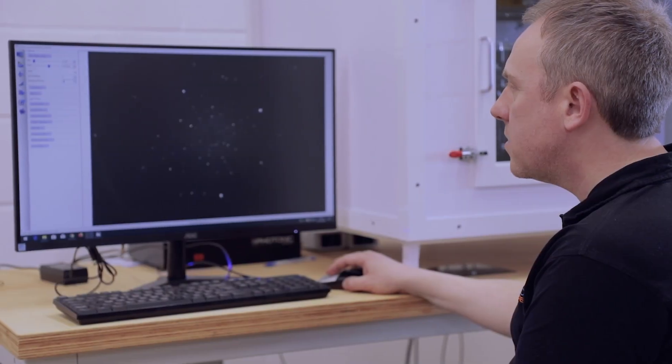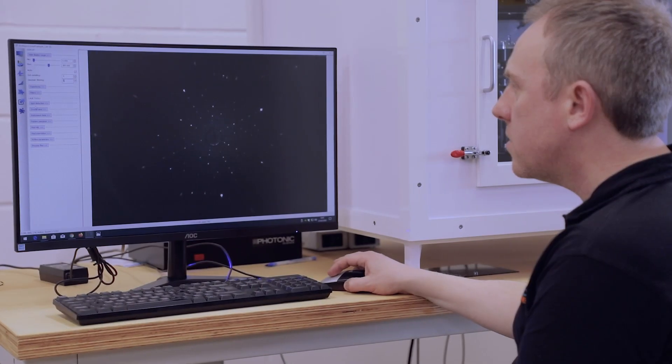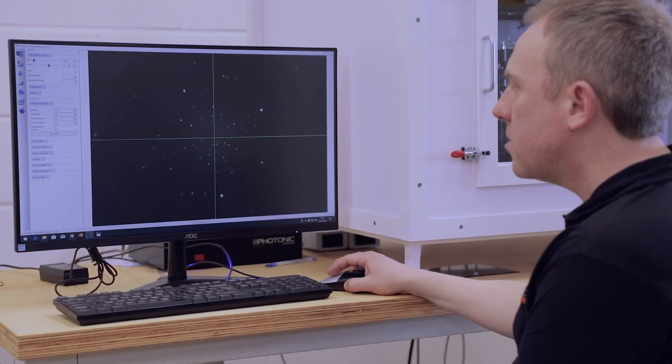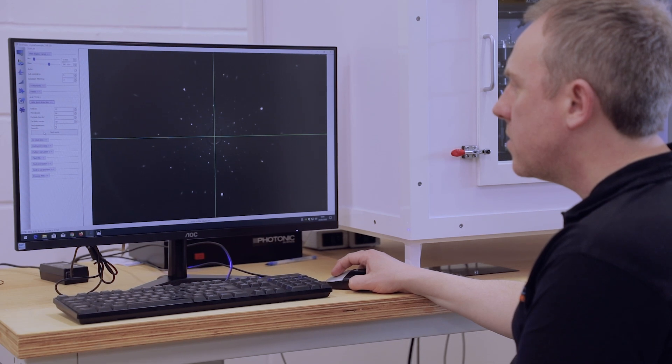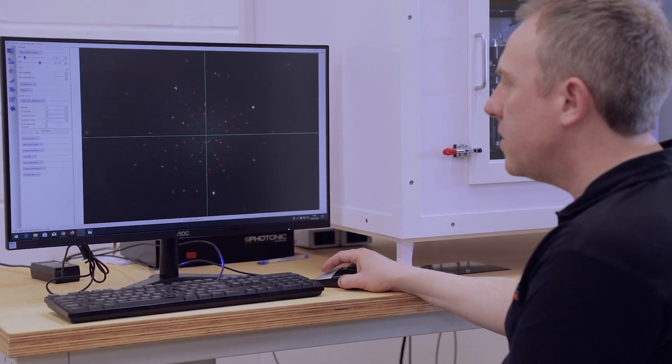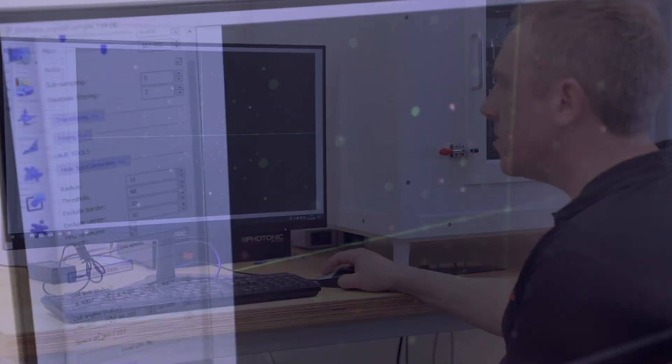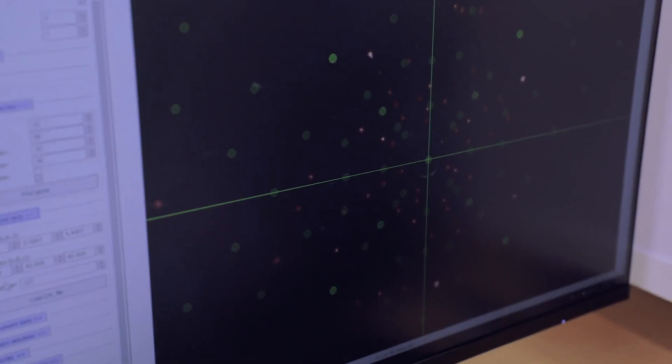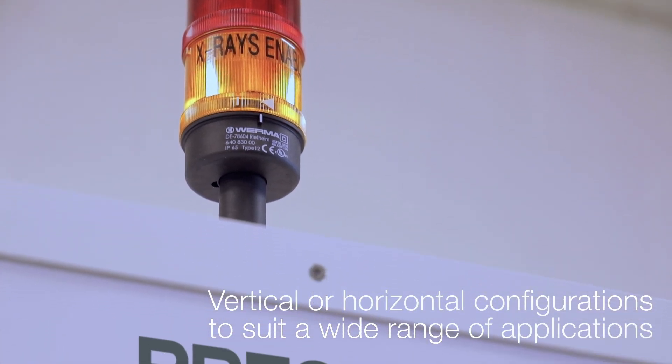The camera generates a pattern of spots which we can analyse in the computer software, and use that to fit a pattern to the spots and then work out what the orientation of the crystal is.